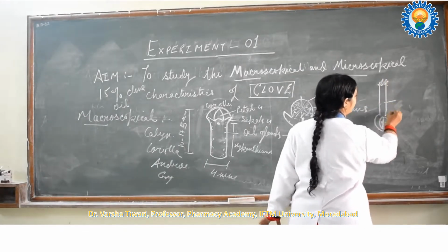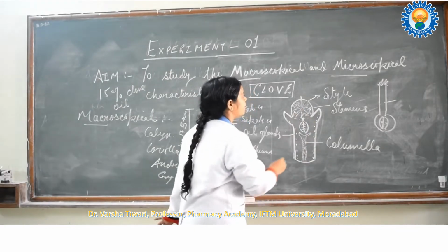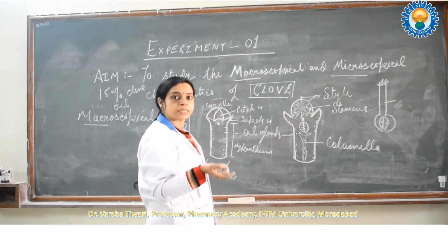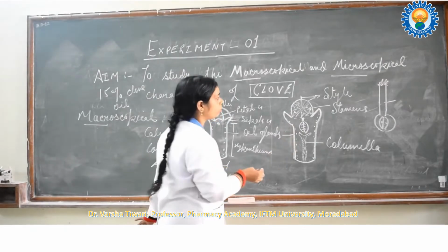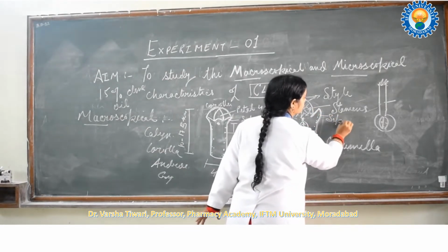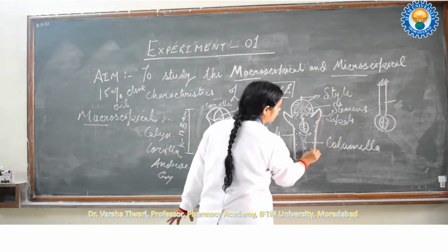So this is the style. The stalk of the ovary is called the style. So this is the gynoecium. Gynoecium contains ovary, style, and stigma. And the style is this. And what are these? Pollen grains are present here. What are pollen grains? Pollen grains are part of the androecium. So all the 4 whorls are present here also: stamens, style, petals, corolla. These are the sepals. So sepals are part of the calyx. And oil glands are present here also.